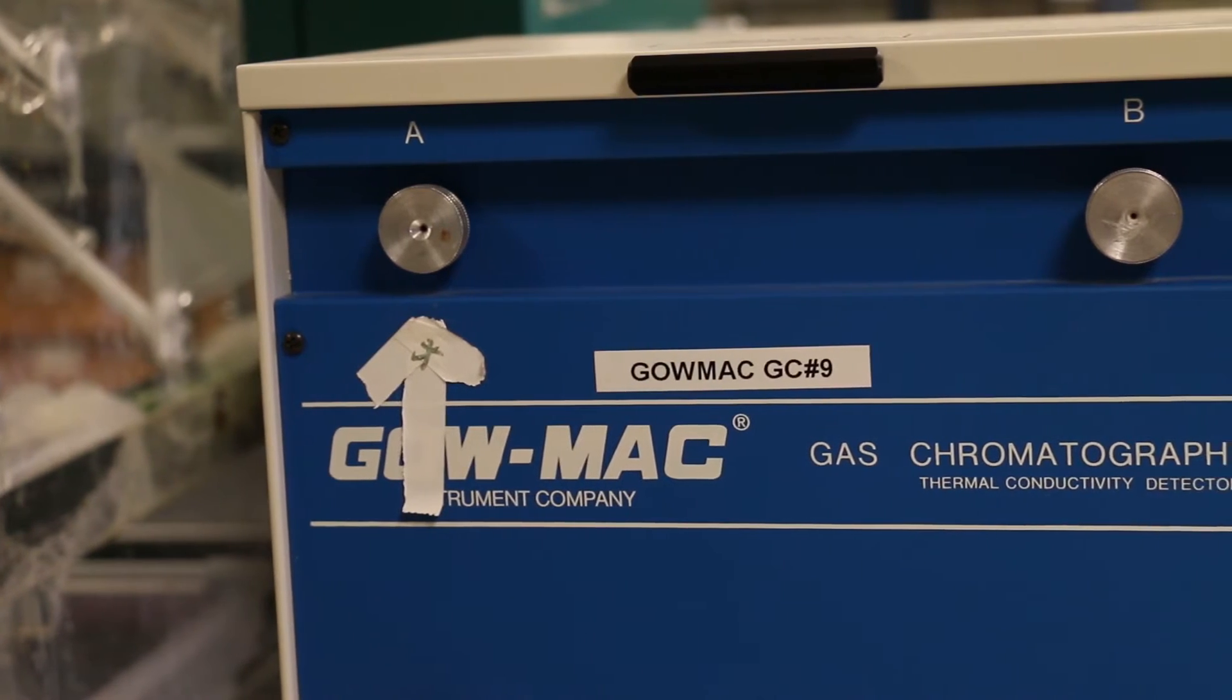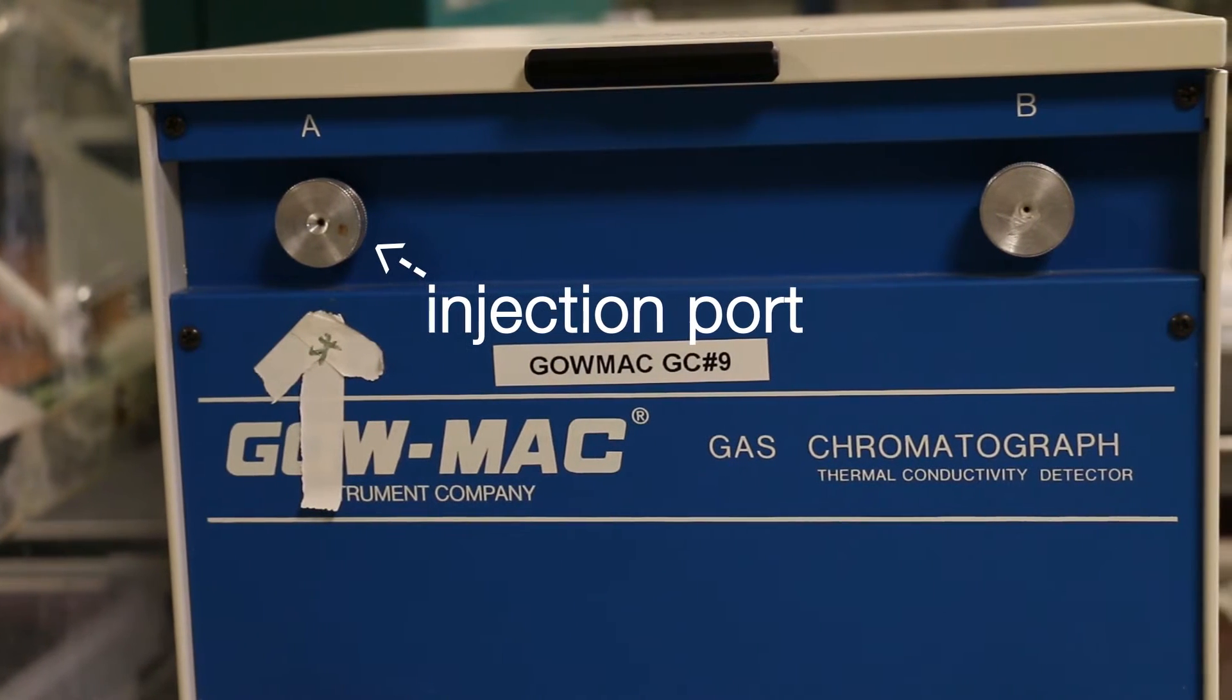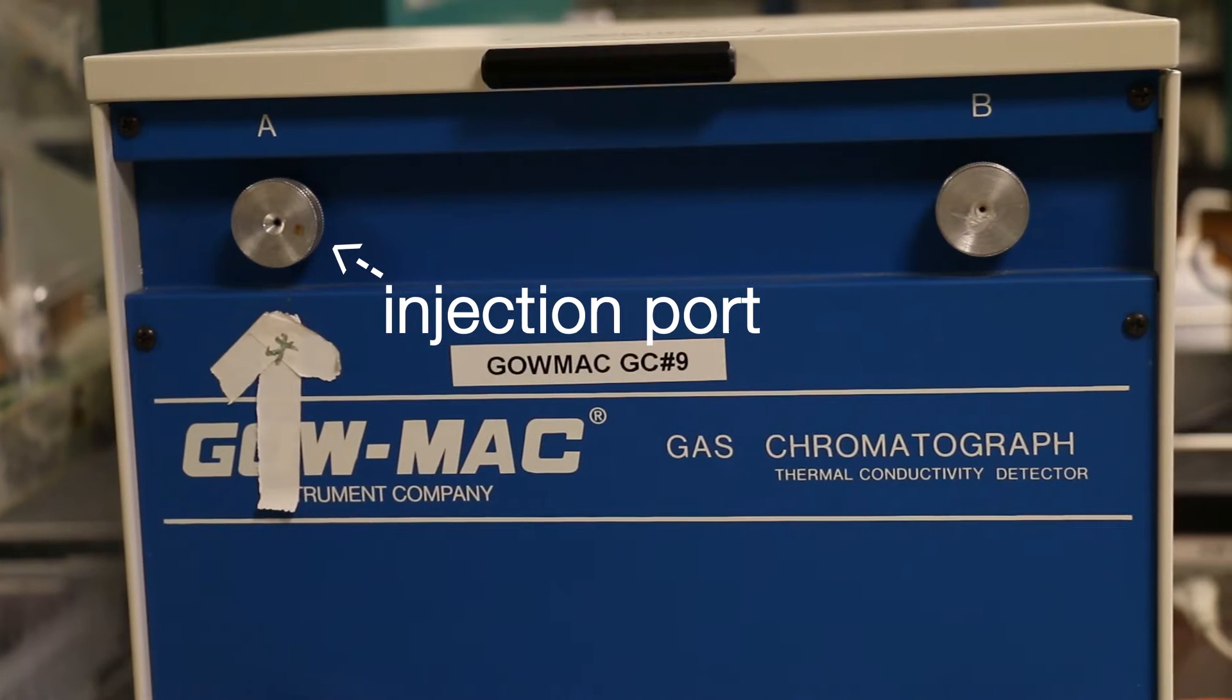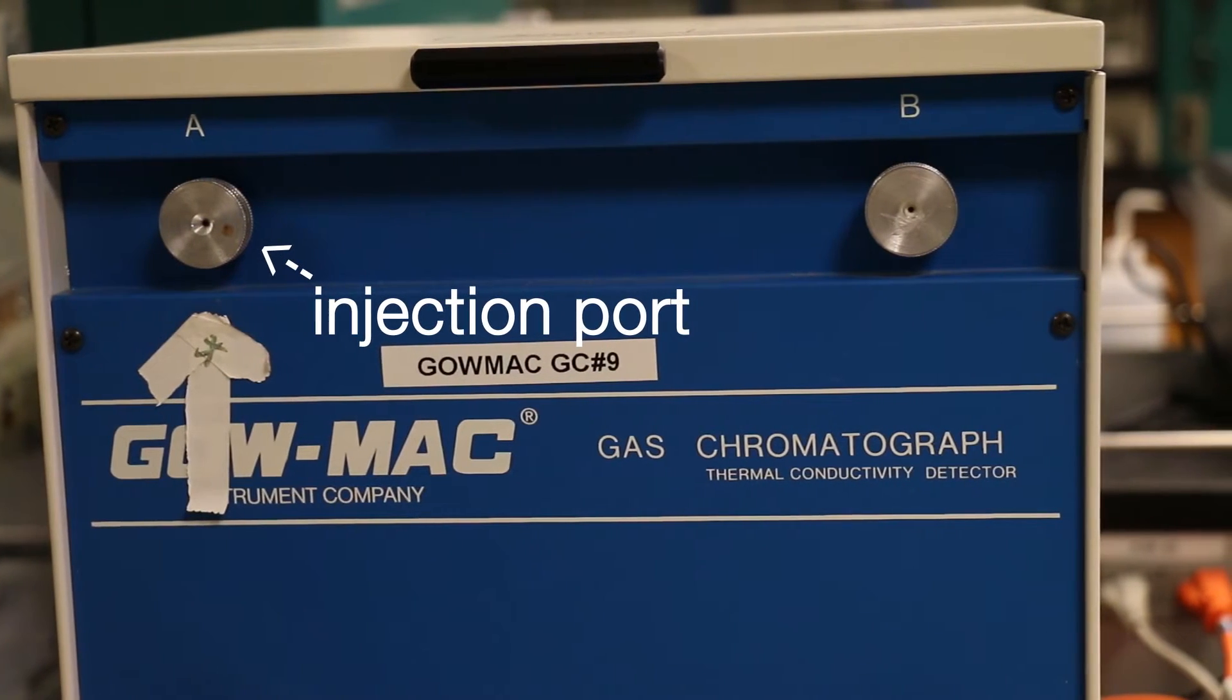The GC sample is injected onto the column through an injection port located on the front of the instrument. The injection port is heated to vaporize the mixture so be careful. Don't rest your hand on the port. It can be very hot.